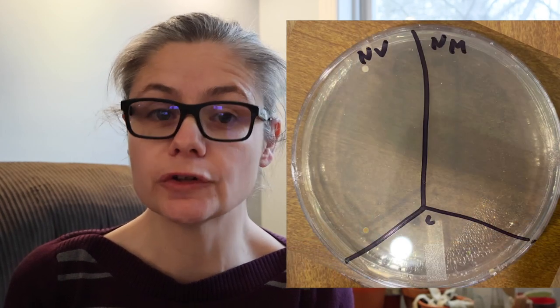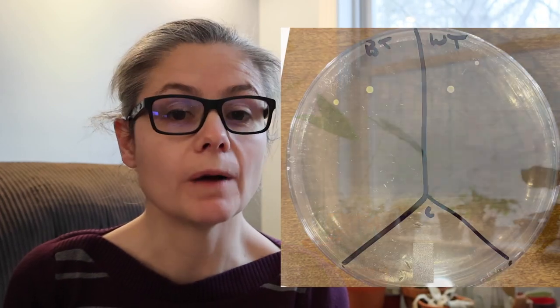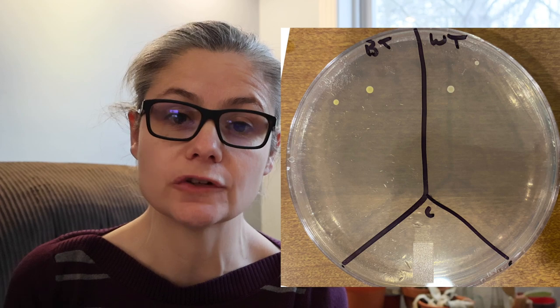Results for flushing with the lid up, week two. So near the vanity, we have two bacterial colonies, and near the mirror, we had none. The wall above the toilet paper, we have three bacterial colonies. In the wall above the towel rack, we have one. The wall behind the toilet has two bacterial colonies, and the wall next to the toilet also has two bacterial colonies. So these really weren't the kind of results that I was expecting.